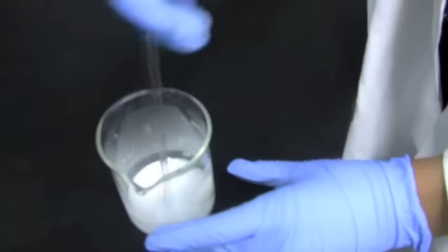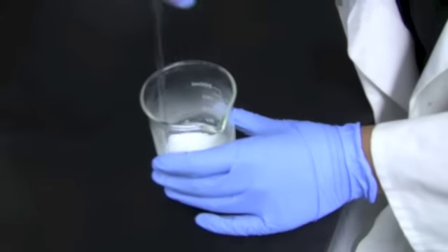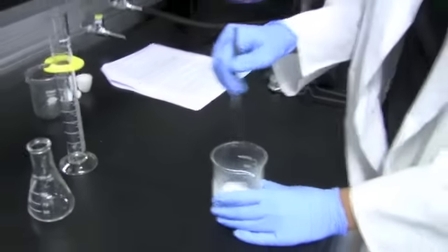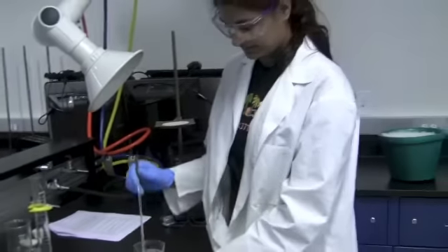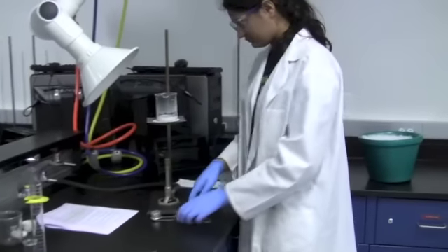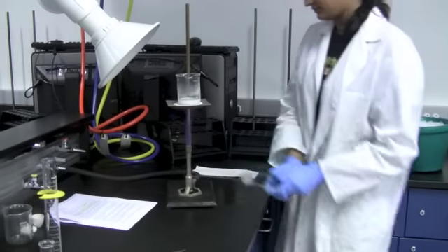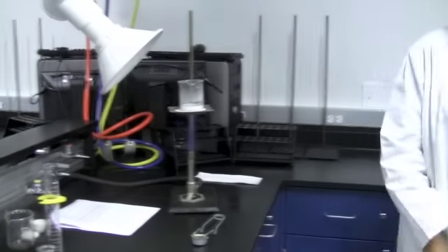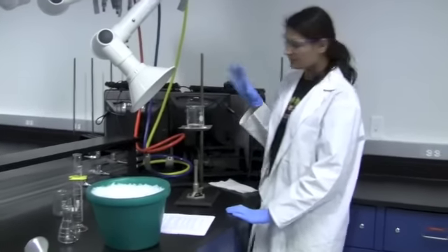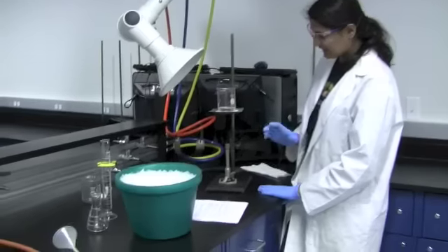Now, you should be doing this for a few minutes, and if you still have a lot of precipitate forming, you need to heat it. And you're going to need to continue to heat it until you have 25 milliliters of solution remaining. Now remember, you're going to be doing everything under the hood. So once your precipitate has completely dissolved, you're going to have a clear solution once again.